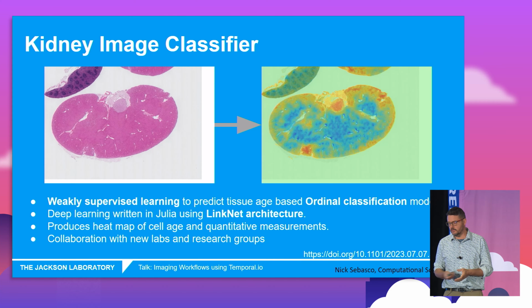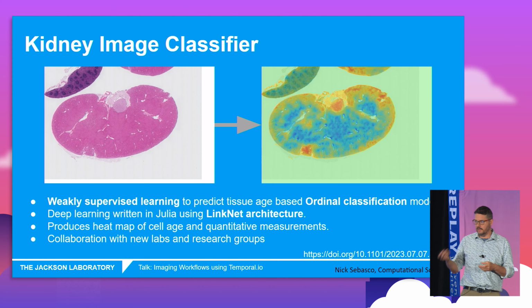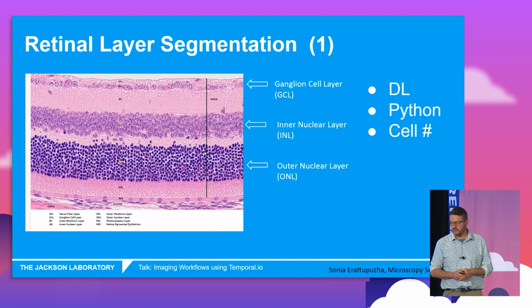So then the researchers can use that to figure out where their experimental conditions have had an effect within the cells of that tissue. And we think that's got a huge... We think machine learning in general, like everybody in the world at the moment, has great potential. So I'll show you a couple more examples with deep learning. So this is back to the eyeball.